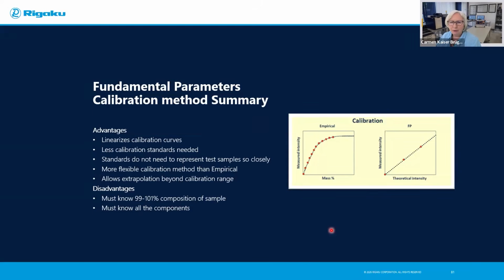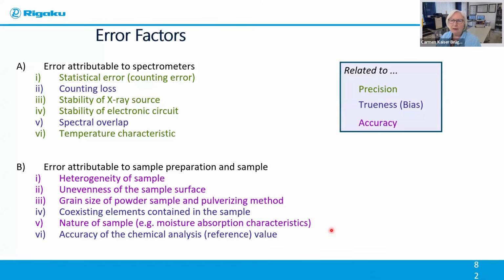So very often people forget about where uncertainties of measurement could come from, or where the errors are related to. So very often our analytical errors can affect precision and accuracy from different parts.